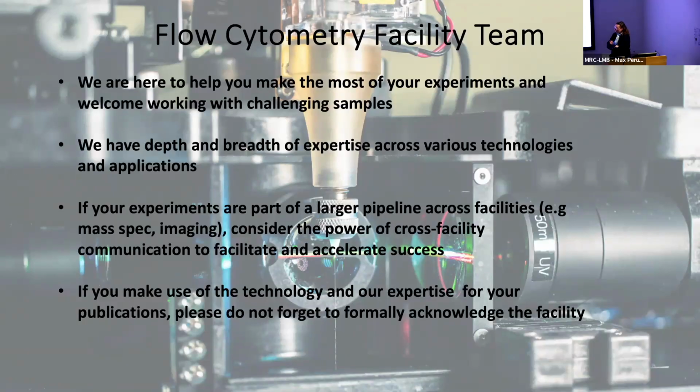I currently have also a collaboration ongoing with Kat Franco in mass spec and Aidan Zetto to look at some more details about whether or not certain polymer dyes can cause some issues with downstream mass spec. So this is a good example where cross-facility communication can really help to troubleshoot potentially anything that you're having issues with.